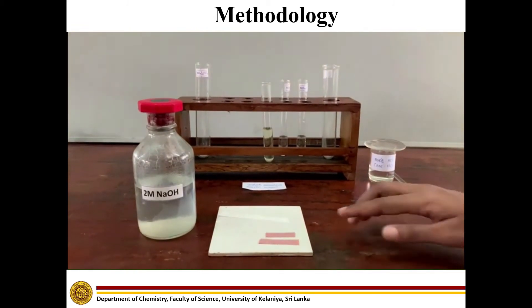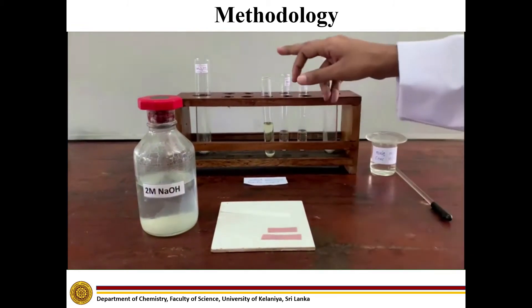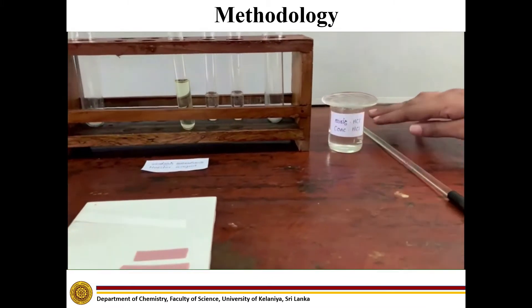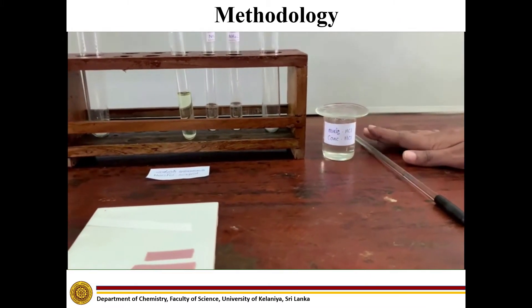Then test the evolving gas using litmus paper, filter paper dipped in Nessler reagent, and a glass rod dipped in concentrated hydrochloric acid.